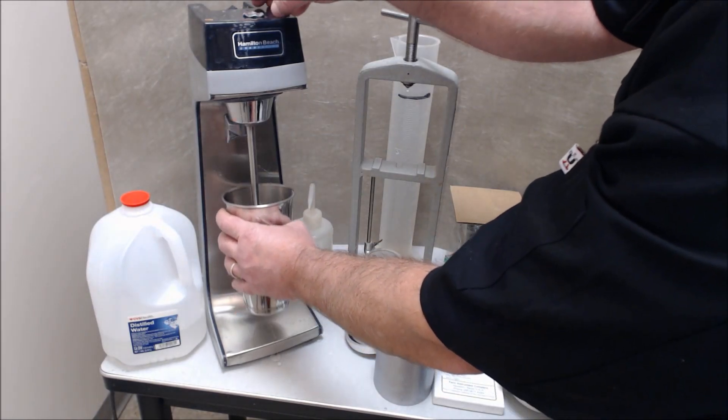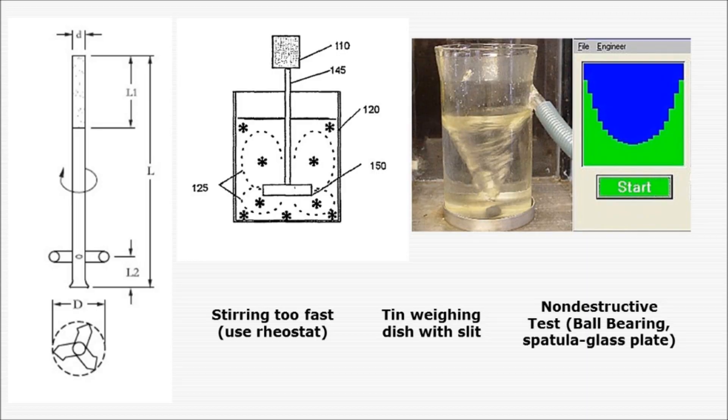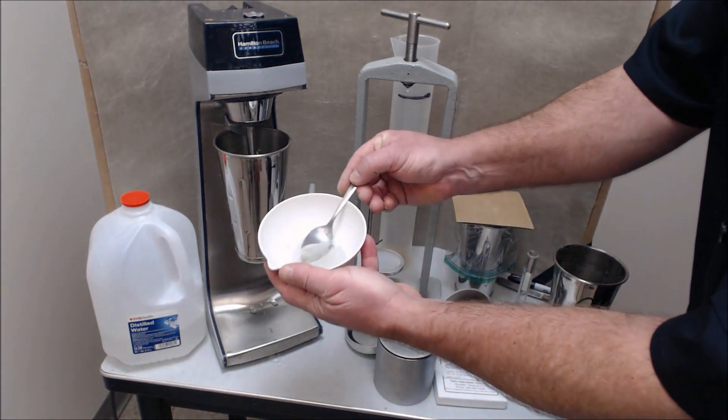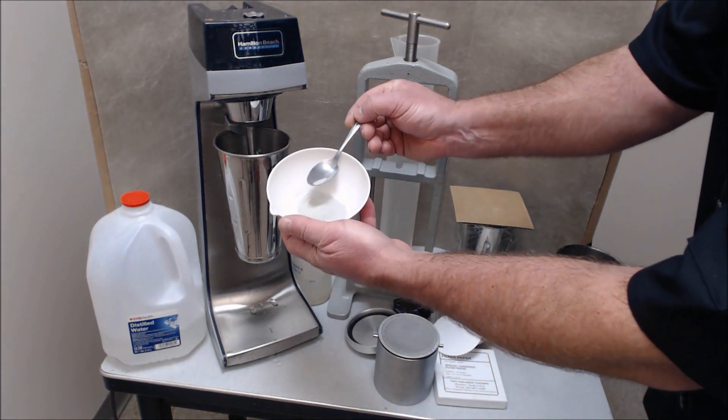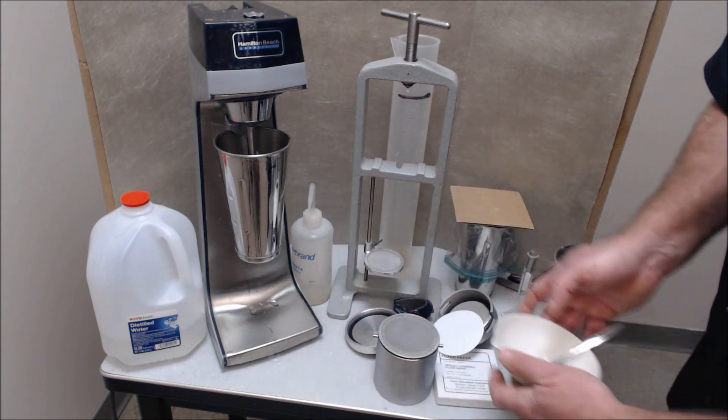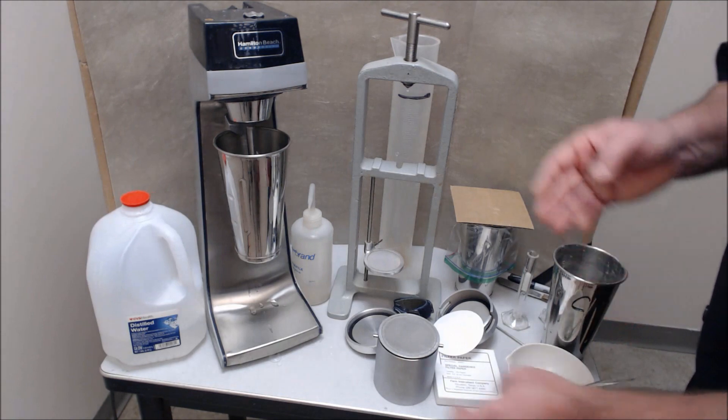While you have it mixing, you then introduce the powder. I turned it off because it was making too much noise, but you'll introduce the powdered infill material that you prepared incrementally into the cup of the mixer.